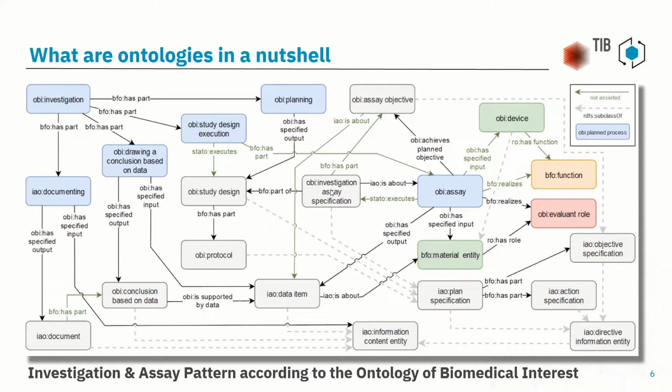Basically, the plan that you either wrote down or copied from elsewhere that tells you how to do your assay, how to set your devices, how to configure them, how to prepare a sample, and how to measure in what kind of timeline or using what kind of other devices and other parts.